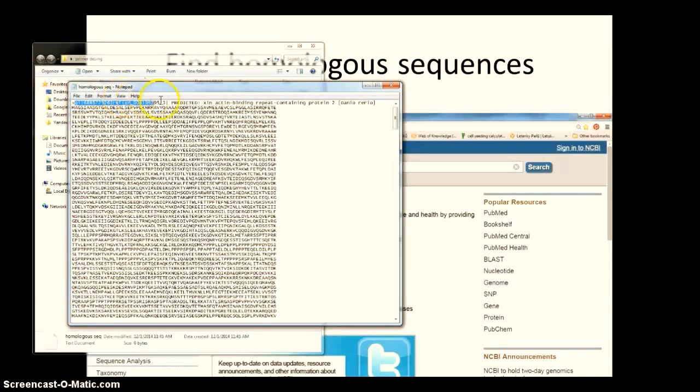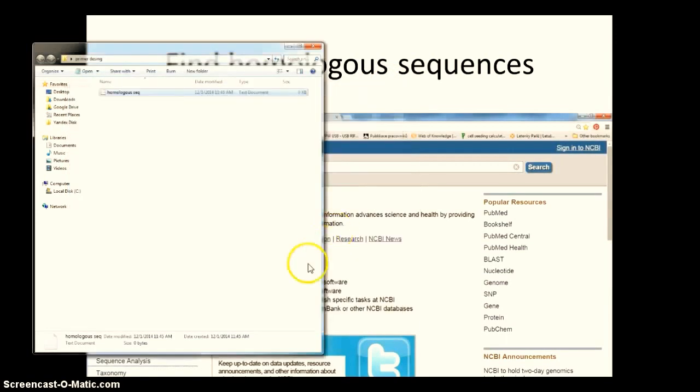When you combine the alignment you will see these numbers, and if you don't remember the exact number it will be hard, but anytime you can choose and delete it, it doesn't matter. So let's close it.